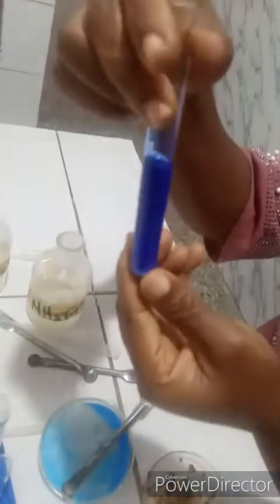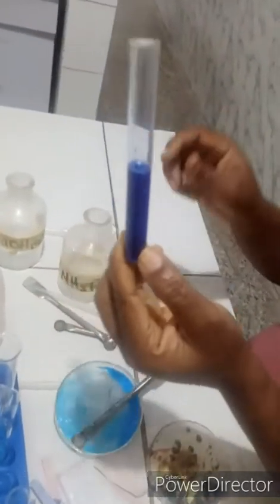Okay, shake the solution properly. I'm sure you are noting the observation. Shake it properly. You can see that the precipitate dissolved to give us a deep blue solution. This is because of the formation of a complex compound with aqueous ammonia, tetraammine copper 2 ion. That is what is giving you the deep blue color. It is a confirmatory test for copper 2 plus. So the inference is copper 2 plus is confirmed.